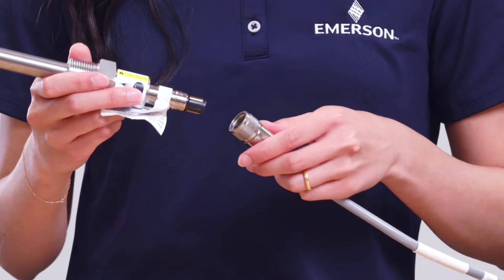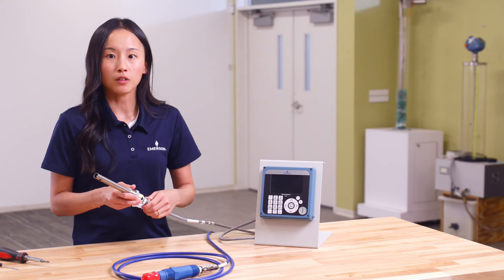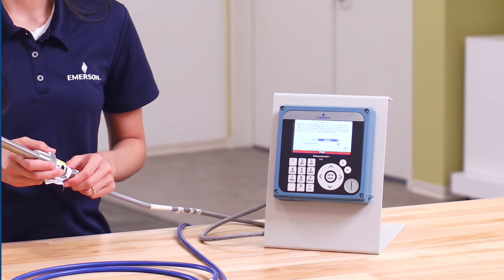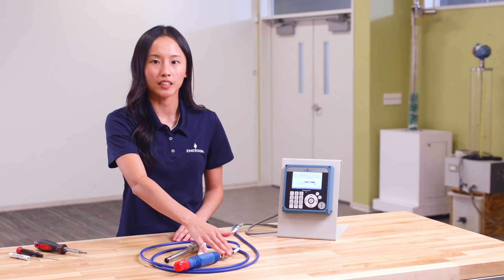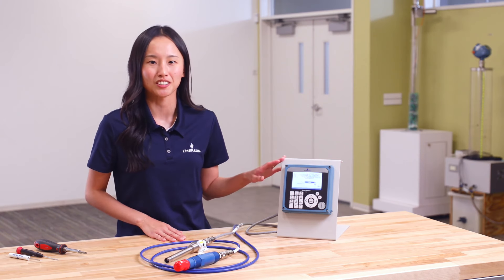Attach the VP connection, then power up the transmitter, and begin the quick start initial configuration process. This completes the overview of how to connect a Rosemount PH/ORP sensor and contacting conductivity sensor to a Rosemount 1058 dual-channel transmitter.